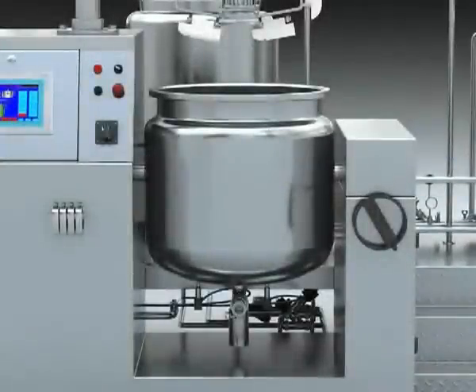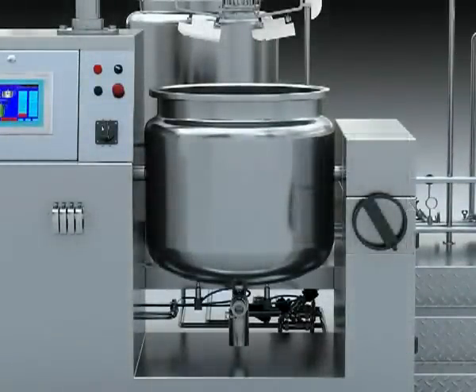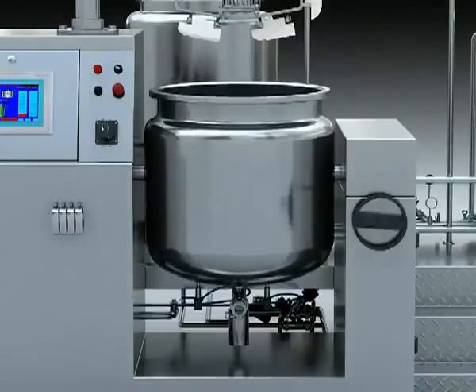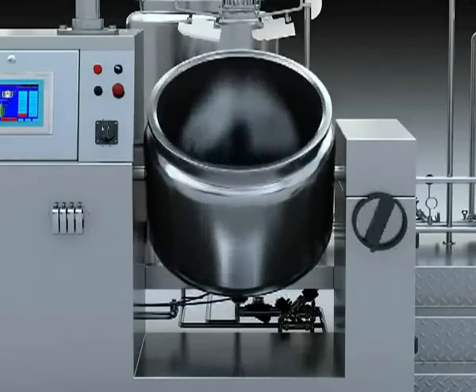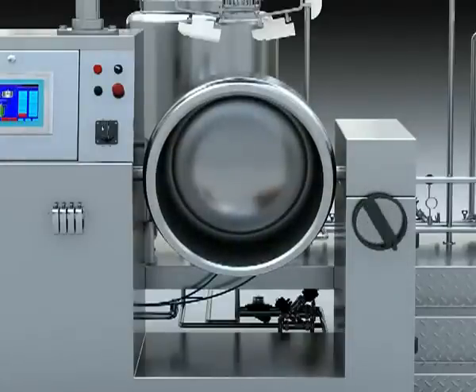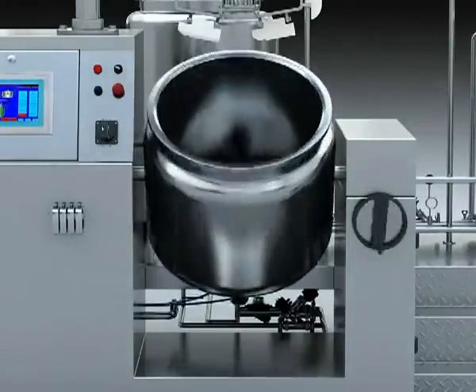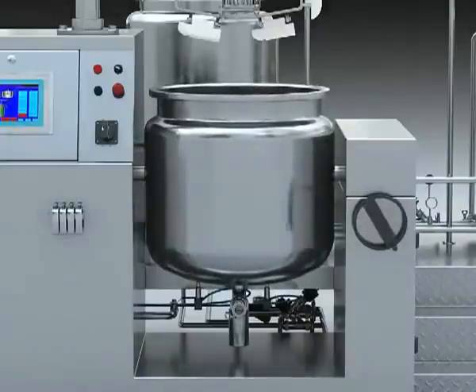4. Discharge system. It is made up of a discharge handle wheel, worm screw, and worm wheel. When the emulsifier gets to the upper limit, forward swing the discharge handle wheel until the tank leans to the point that the upper is lower than the bottom — the discharge limit. Then reverse wind the discharge handle wheel and the tank will reset to the normal state.